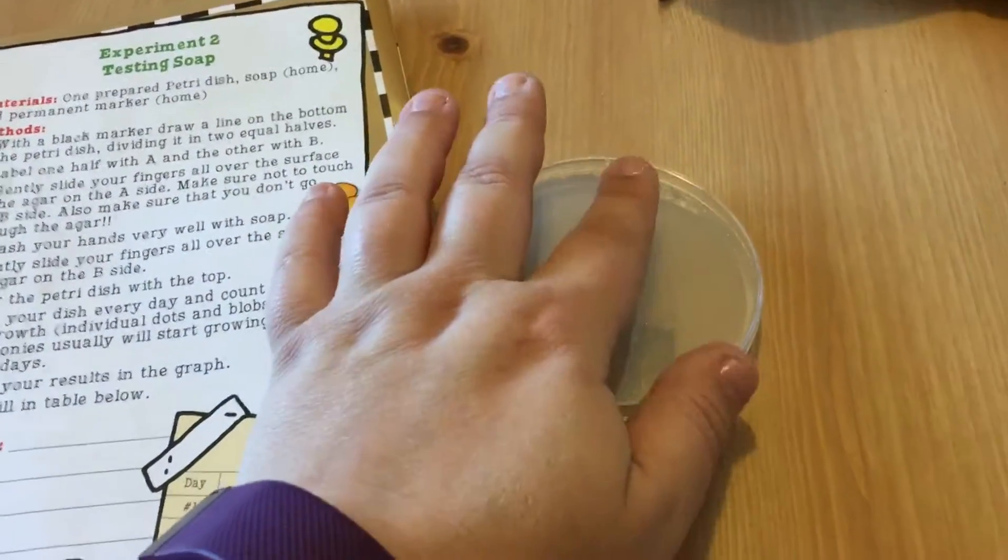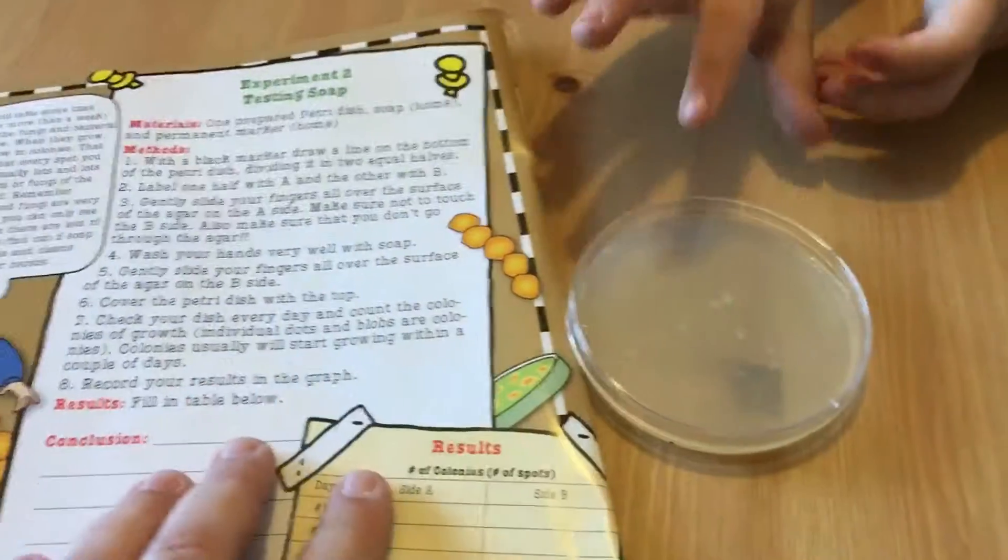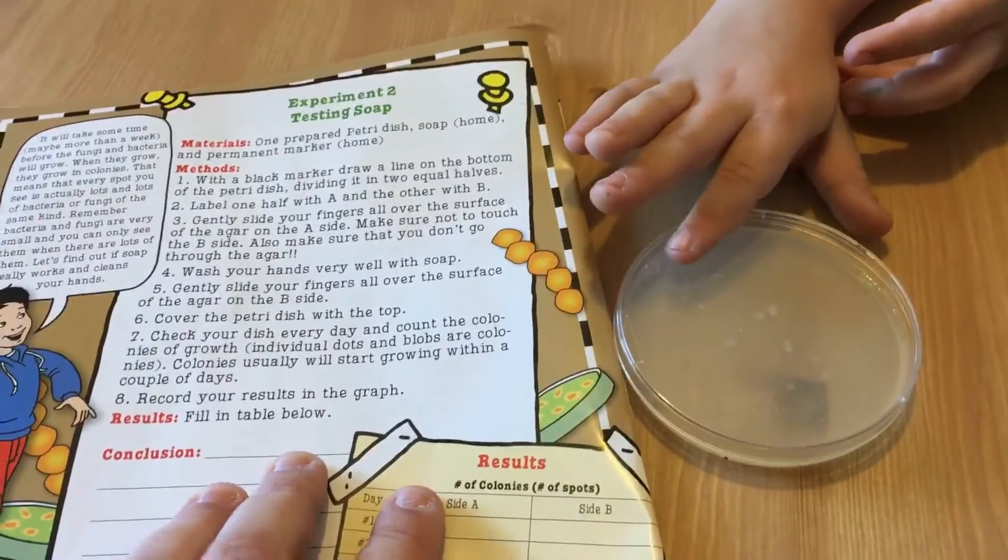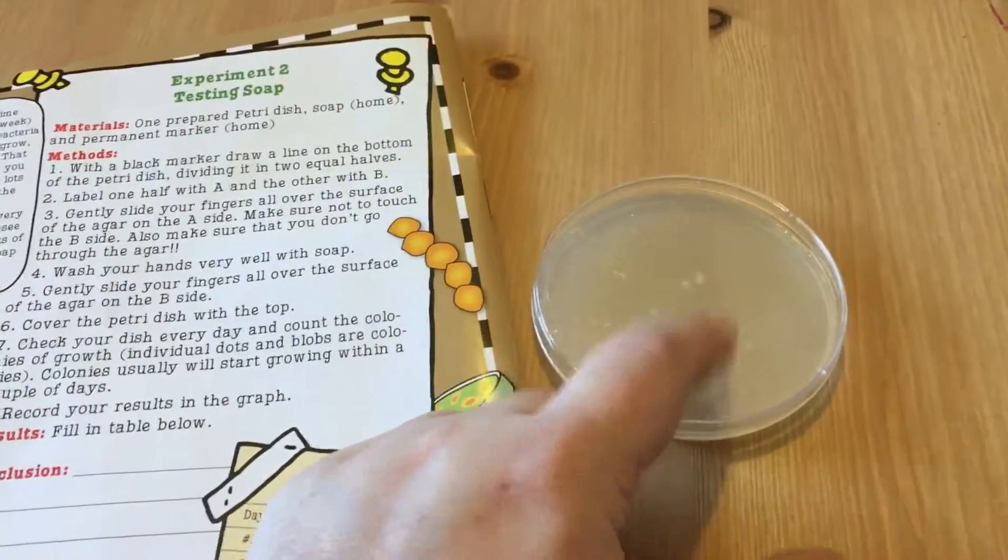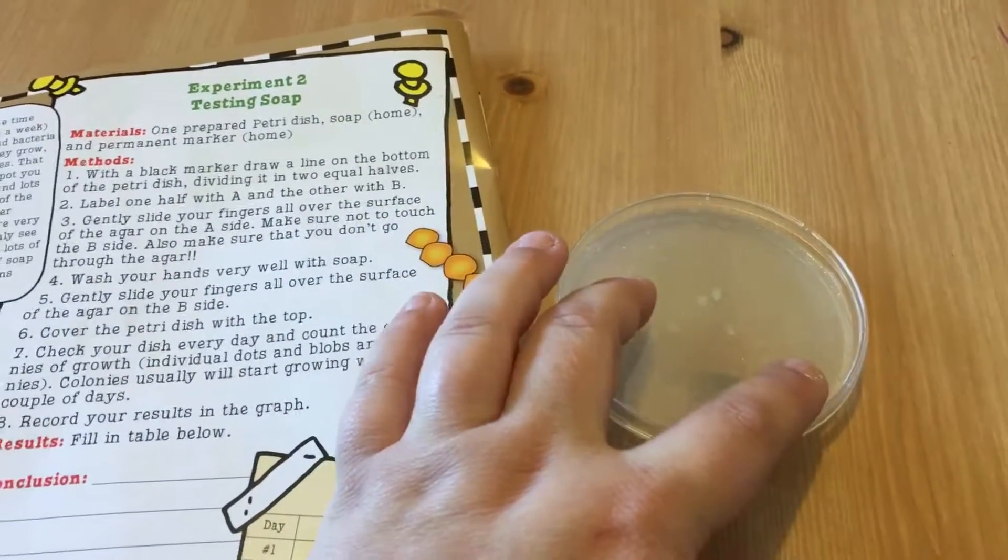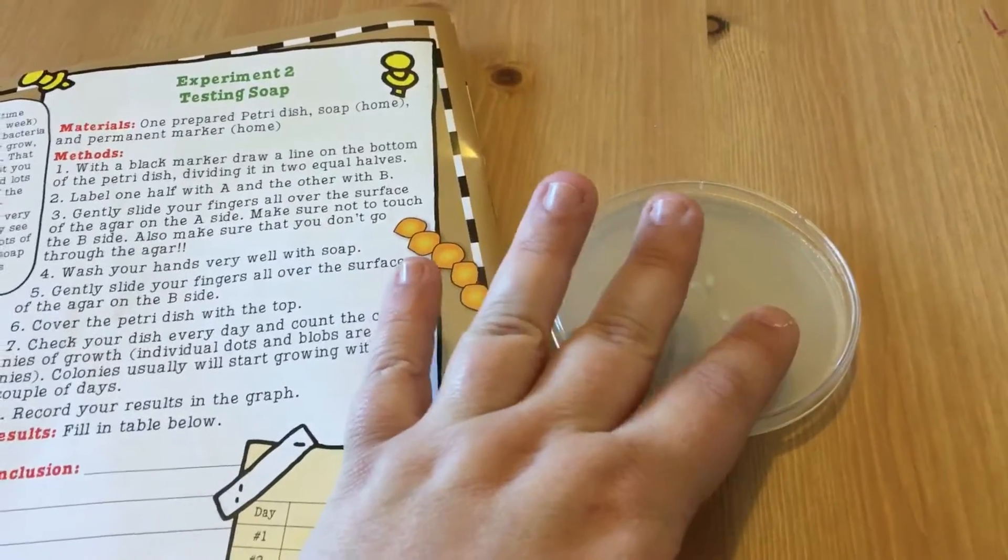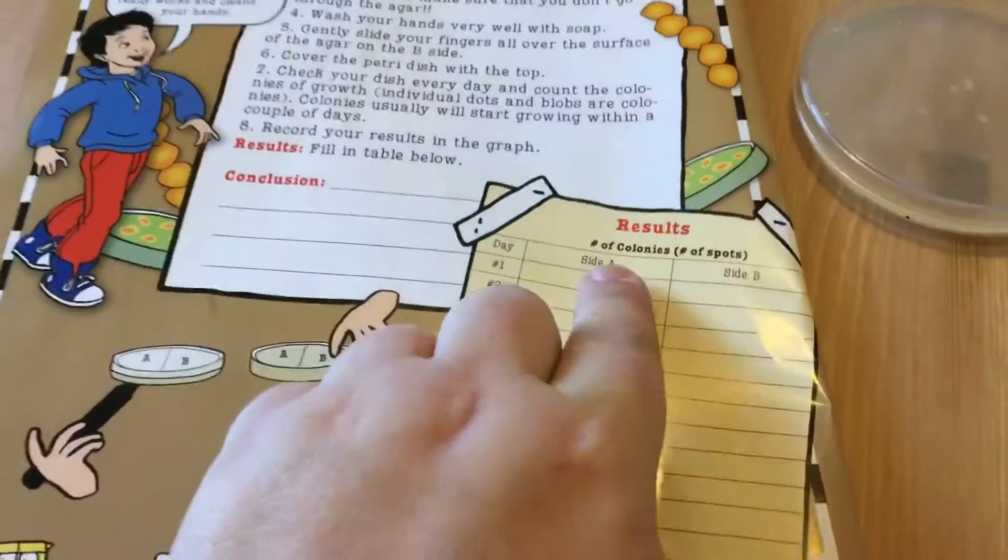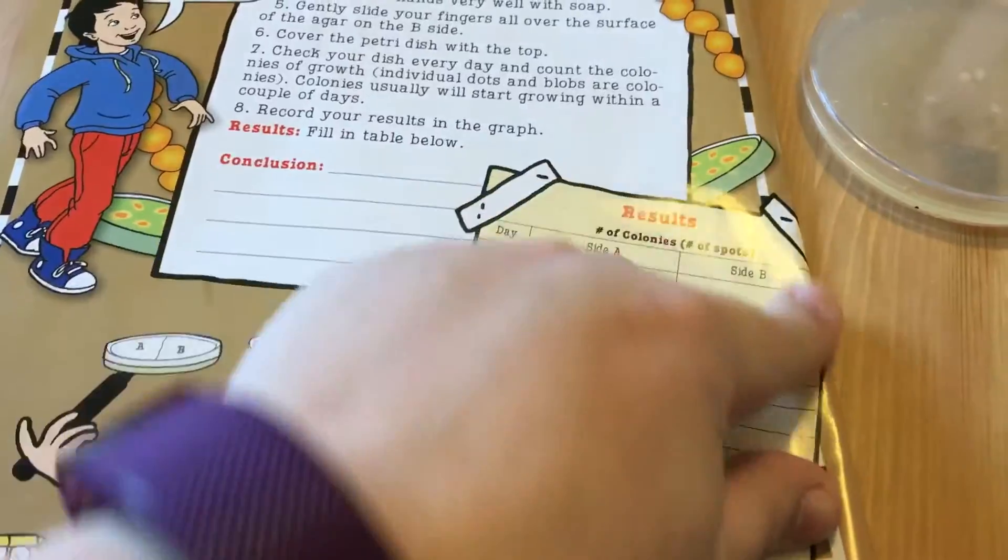And we are going to see how well soap works. Are we going to get bacteria growing on both sides? Is it going to be the same bacteria? Will one side have bacteria, will one side not? We're not sure.